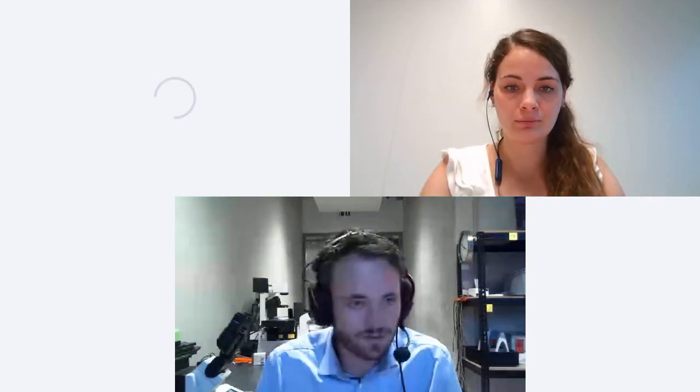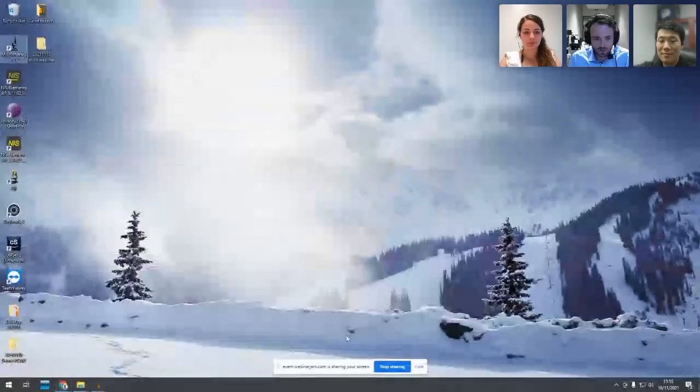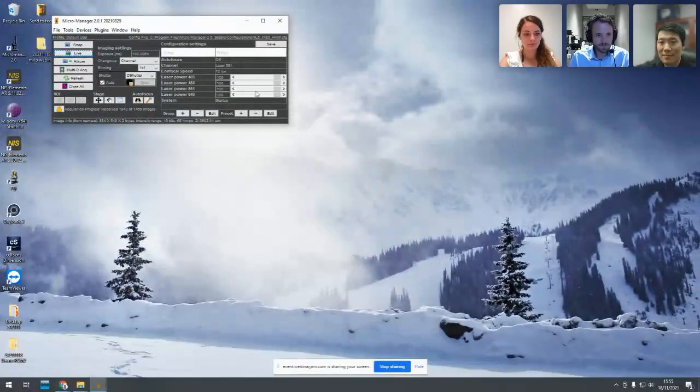It was a really interesting presentation, and also it was good to see how fast the NL5 can scan the sample. Could you show us whether the NL5 can provide homogeneous light on the whole frame? Yeah, sure. Because it can be important. Very good one.